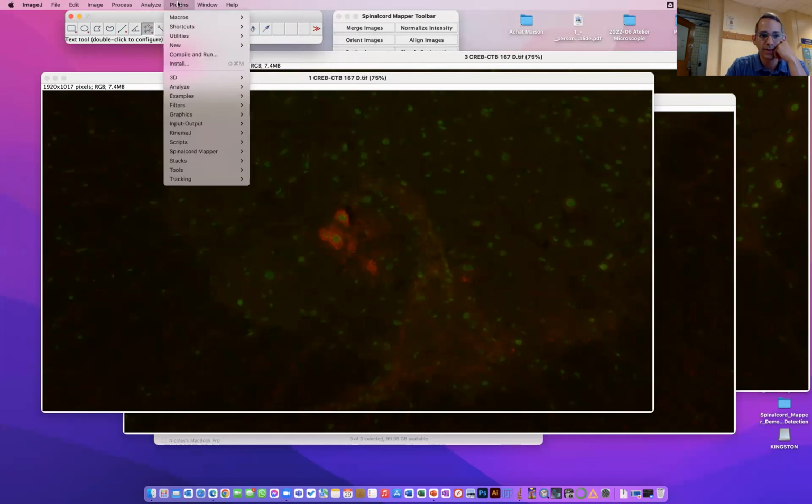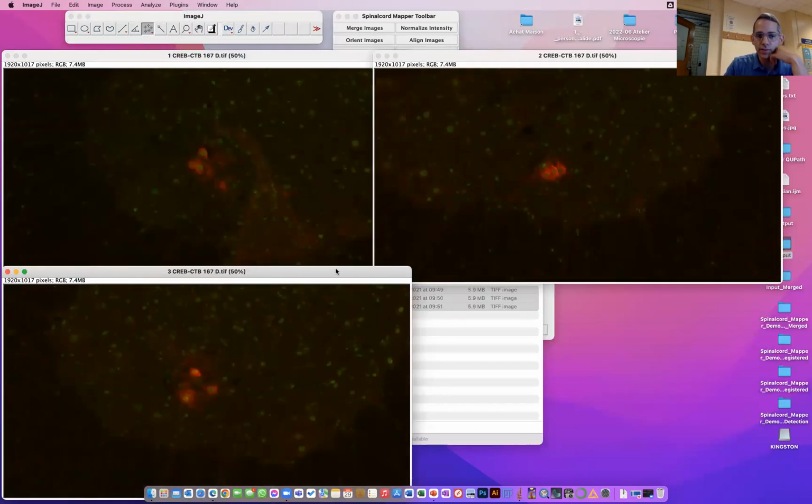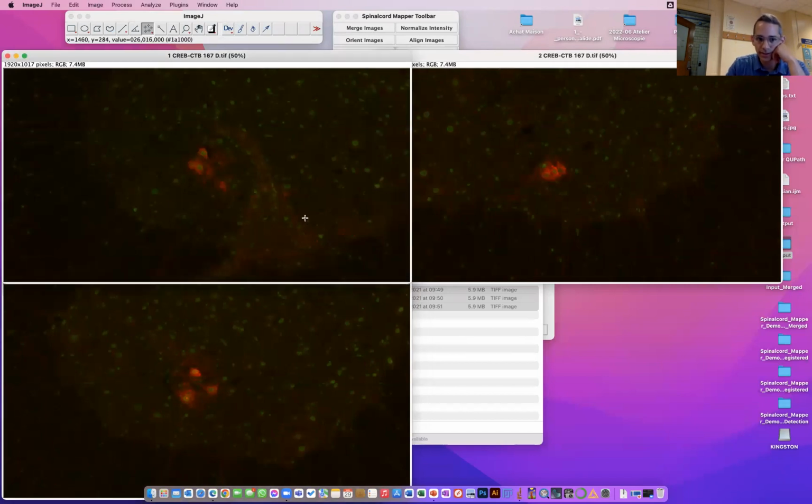So RGB format is not very good when you have to export. It's okay that the colors are there, but RGB is not really good. But the good thing is that in this case, you only have R and G. So if I transform this image into a TIFF, a multi-layer TIFF with several channels, this should be fine.